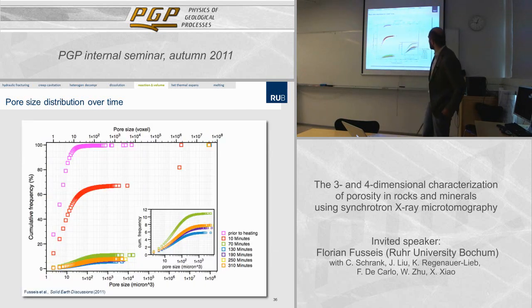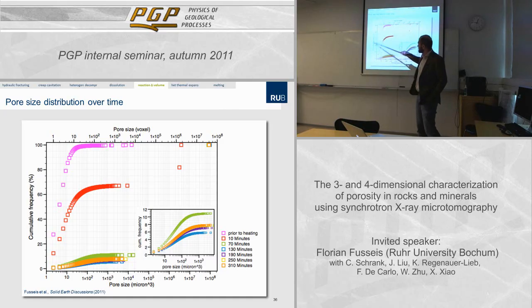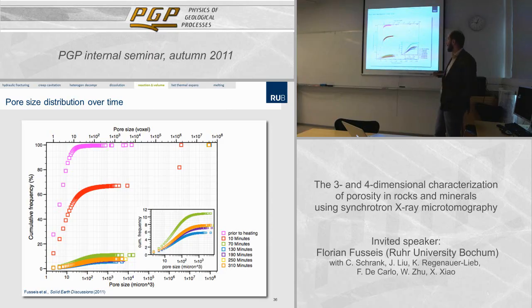This is a plot that shows the pore size over time, the cumulative frequency of particular pore sizes over time. You know these kinds of diagrams from sedimentology, the grain size analysis that you usually get. So that's how you have to read them as well.